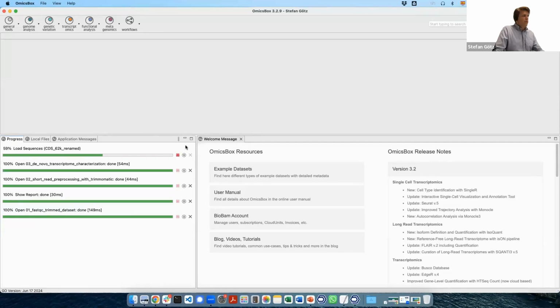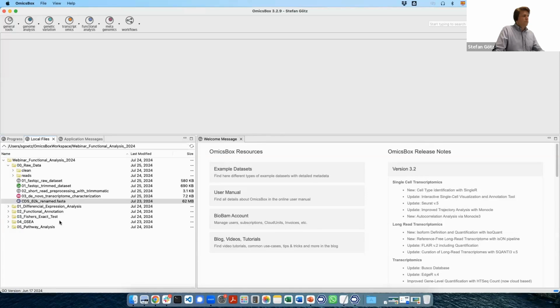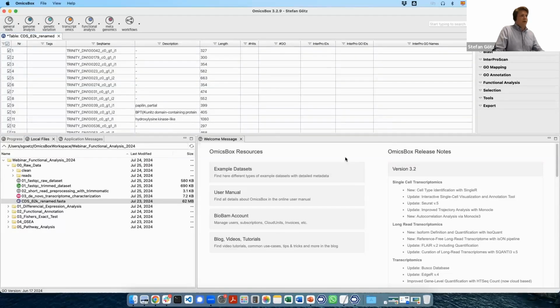And then I'll get this progress over here, and then I'll have my raw sequences here.